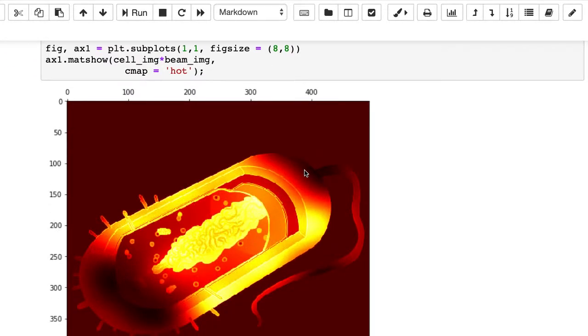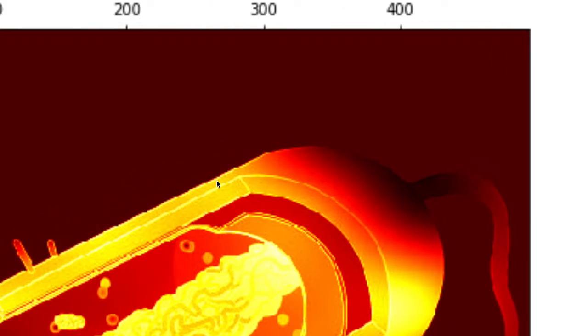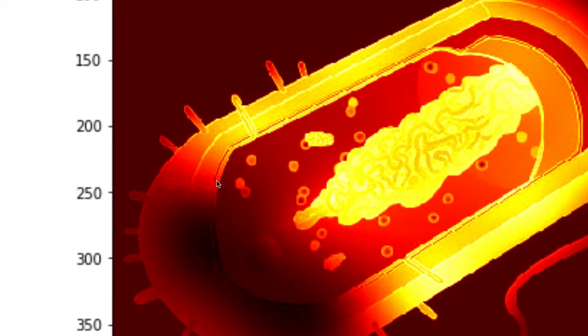And so also when you look at this, it becomes very difficult here to see where the cell boundary actually is. That information, particularly on a projector, is very challenging to make out. And in some cases, if the imaging is done poorly enough, is completely lost. And so when you have these problems, it's very important to know that your ability to extract information from the image is also reduced in areas where the beam profile changes get more severe.